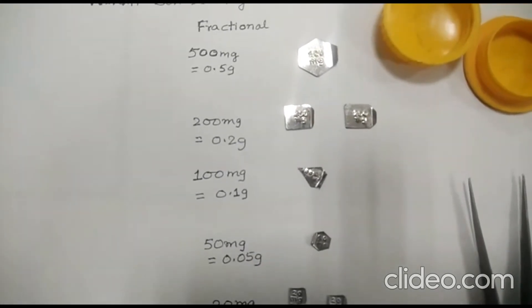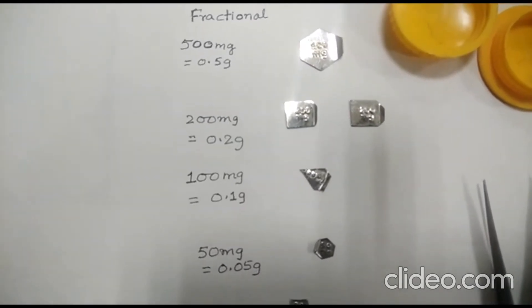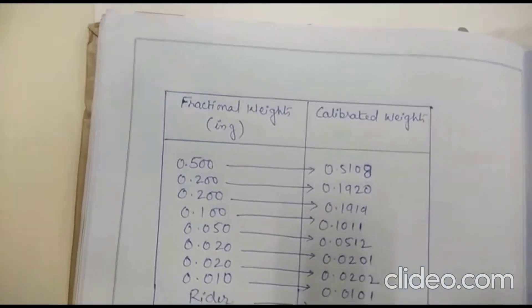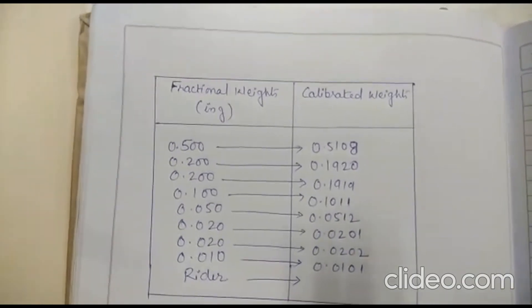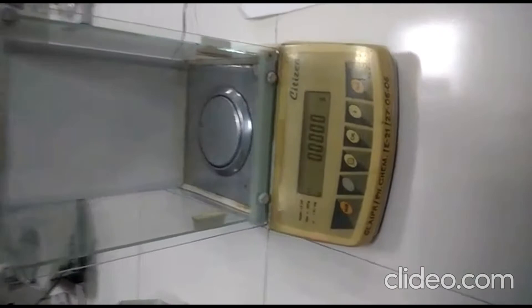We have to calibrate the weights of this fractional weight box, and whatever weight we calculate has to be recorded in our logbook. The logbook will list the fractional weights and the corresponding calibrated weights — the actual weight measured using the digital electronic balance. This balance has a least count of 0.1 milligram and its make is Citizen.